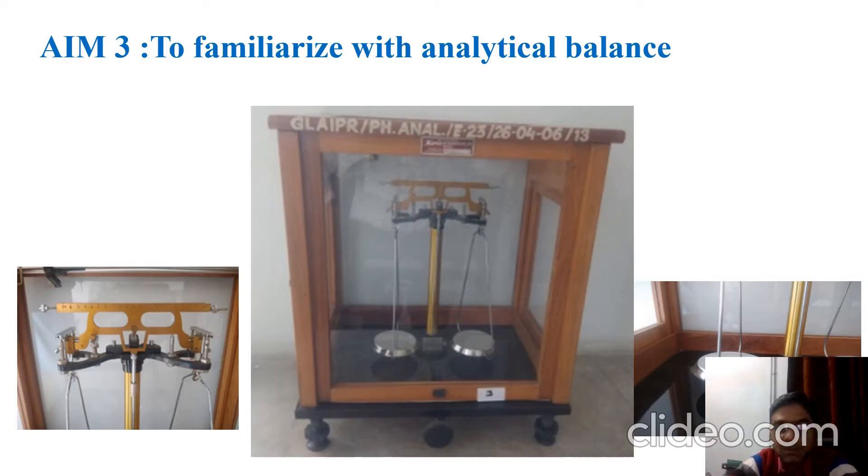The beam is further divided into 50 dots, which clearly signifies that we can weigh 0.2 milligram as the least count on this balance. The balance is made up of a wooden case and has a front glass panel that can be opened.